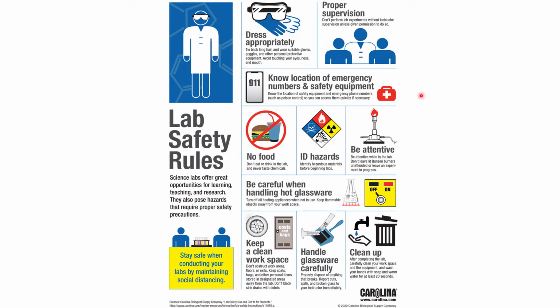These are the different laboratory safety rules that are found inside the clinical laboratory. I know this has already been inculcated in our hearts and in our minds, but just to remind us again that we have to always dress appropriately inside the laboratory. Remember, class, to always wear closed shoes in cases of accidental spills and sprays. That is to protect the skin of our feet in that area.